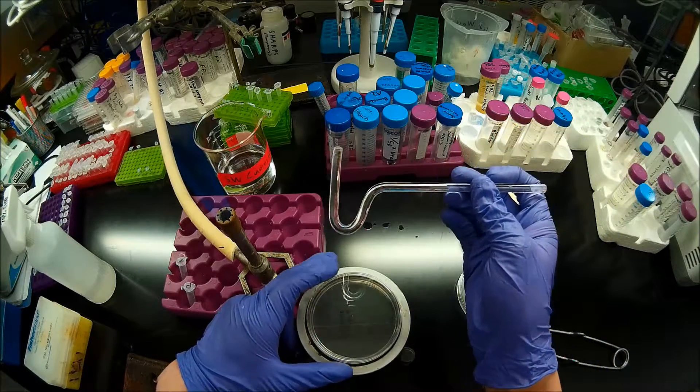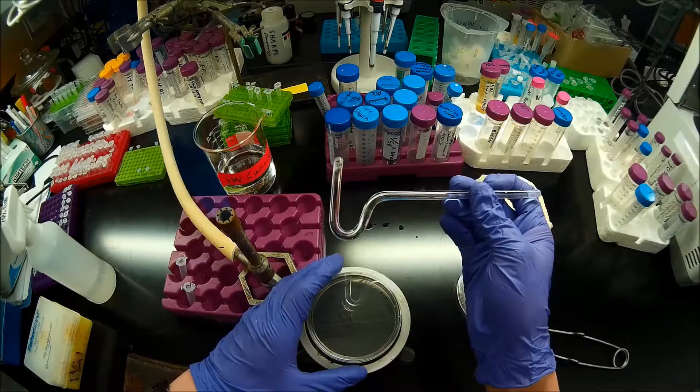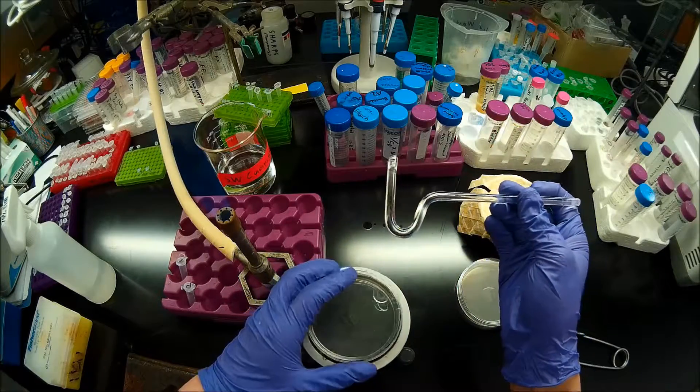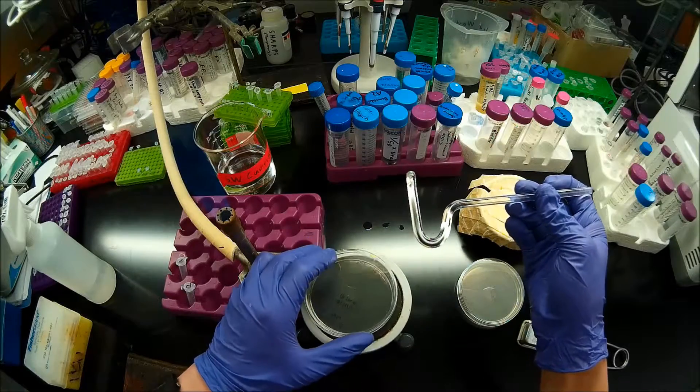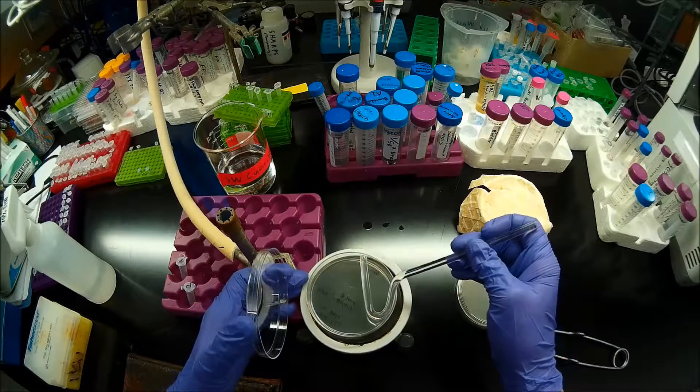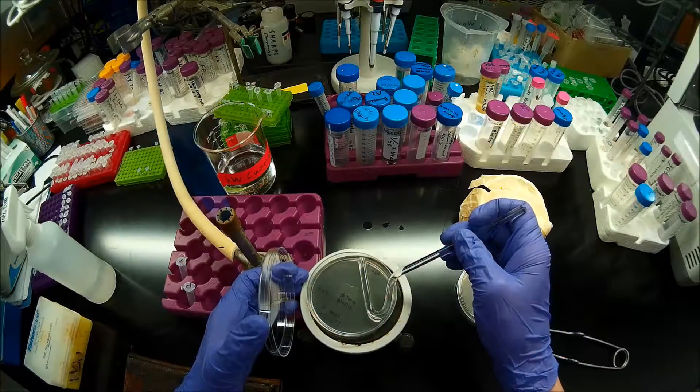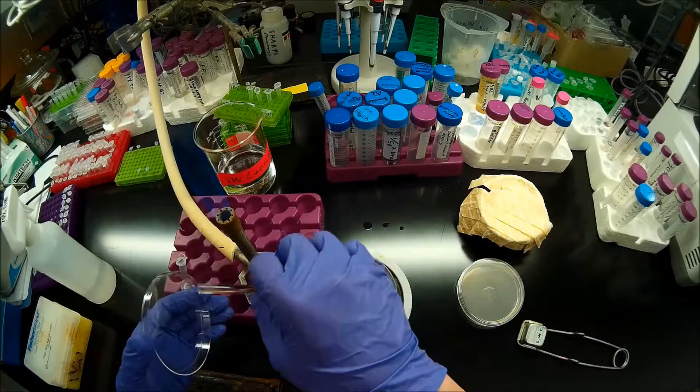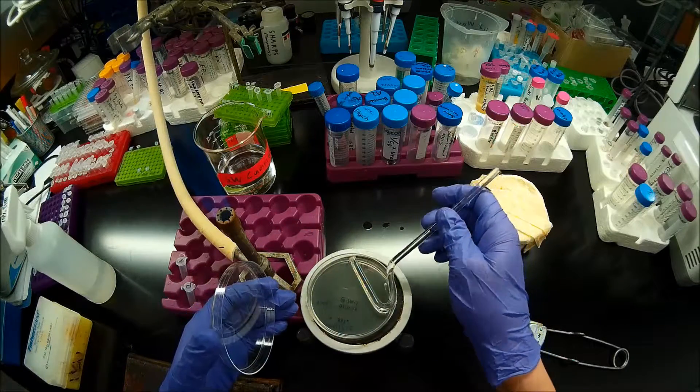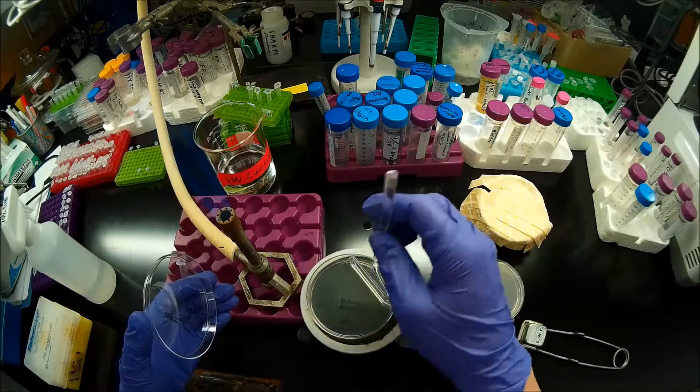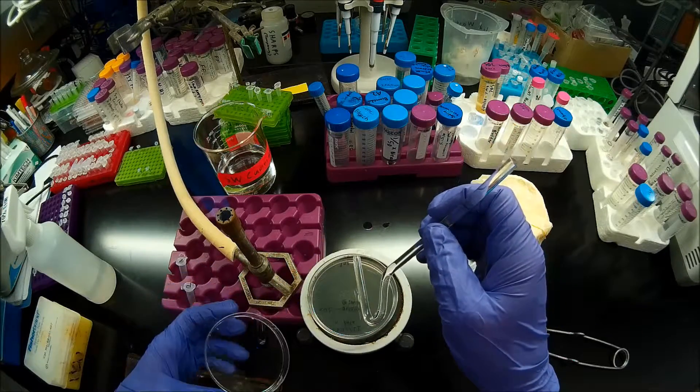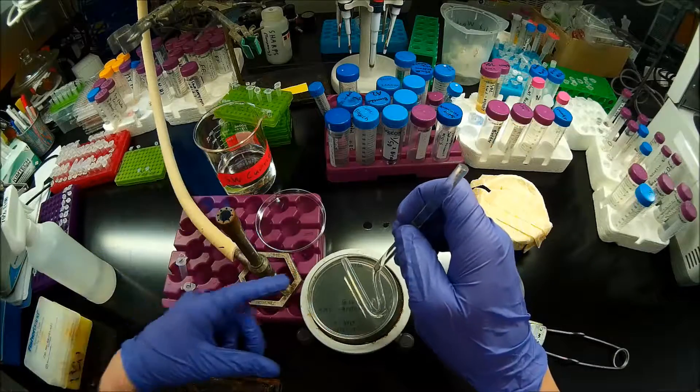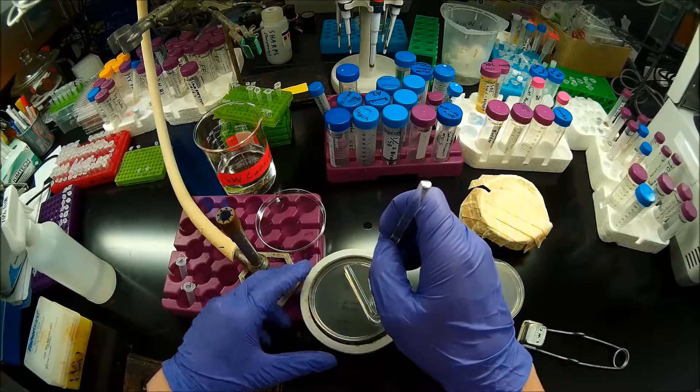Now, this is still pretty warm. Not as warm as it would be if I'd held it in the flame, but it's still warmer than I want it to be when I'm contacting my cells. So when I put it on the plate, I'm actually going to touch it to the plate away from where my cells are, away from where I've dispensed my cells. And I'm going to rock that spreader back and forth a couple times to cool it down on the agar before I go and spread my cells. And that's what I'm going to do now.